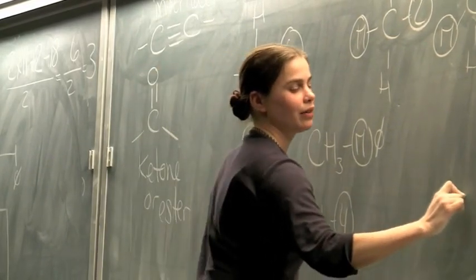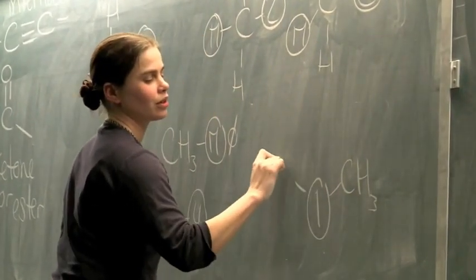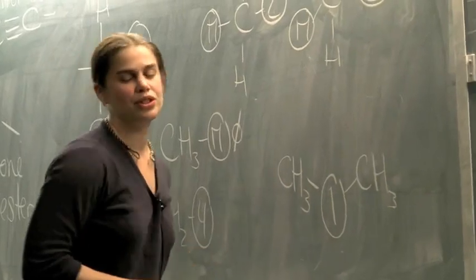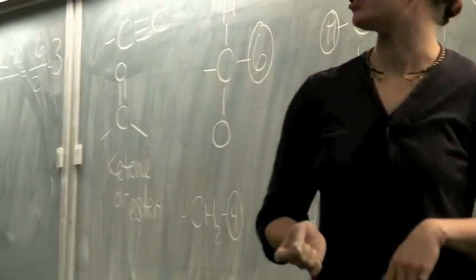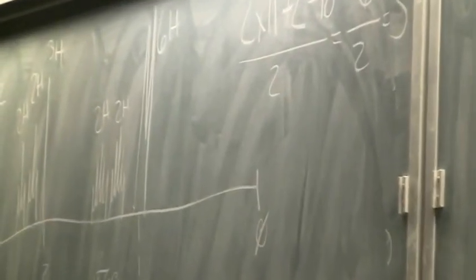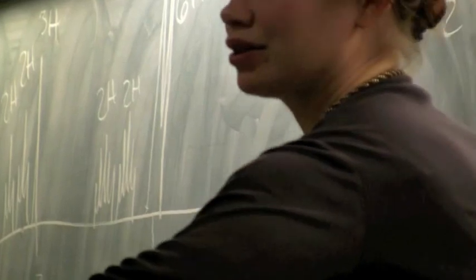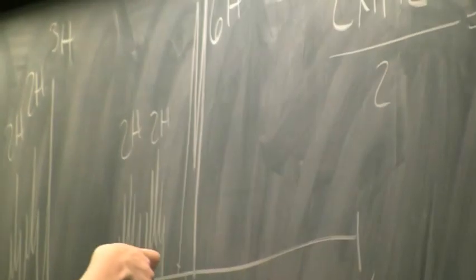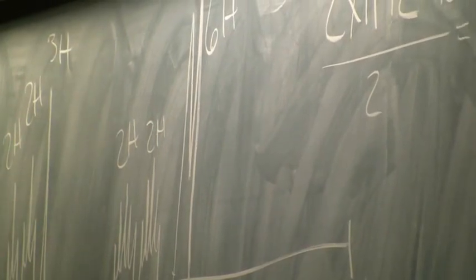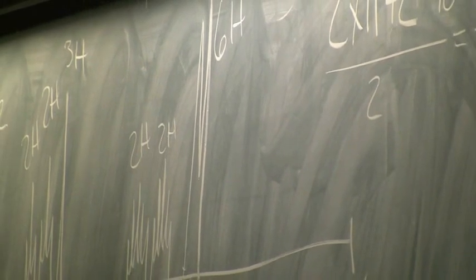Also in that region we have 2 symmetrical CH3s. Symmetry is a big clue. We've got 6 H's or 4 H's or 9 H's. You know they're symmetrical because there's absolutely no way to get that many hydrogens on the same carbon all at the same time. So if you ever see that 6H doublet, you know you've got 2 CH3s on the same carbon and there's one neighbor. And that's always, always true.